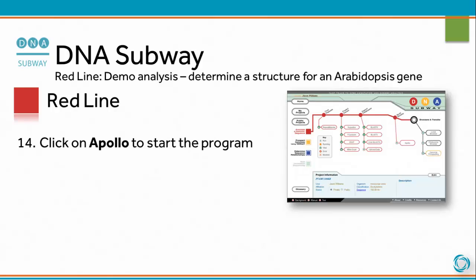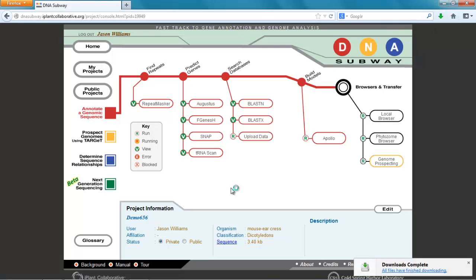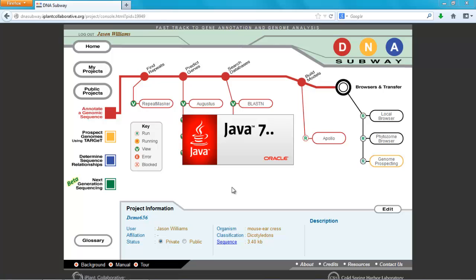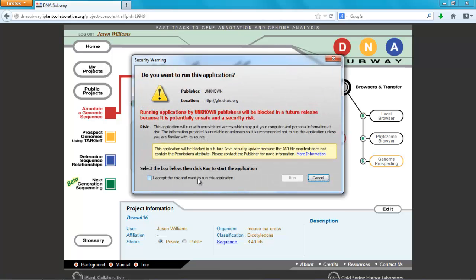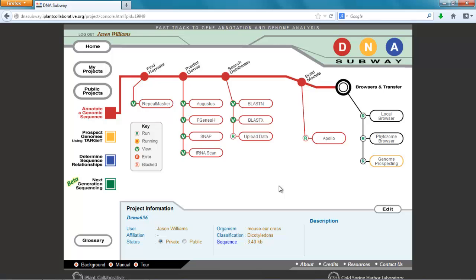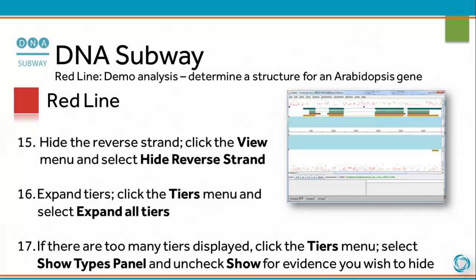Click on Apollo to start the program. In Apollo, hide the reverse strand. Click the View menu and select Hide Reverse Strand. Expand Tiers: click the Tiers menu and select Expand All Tiers. If there are too many tiers displayed, click the Tiers menu, select Show Types Panel, and uncheck Show for evidence you wish to hide.